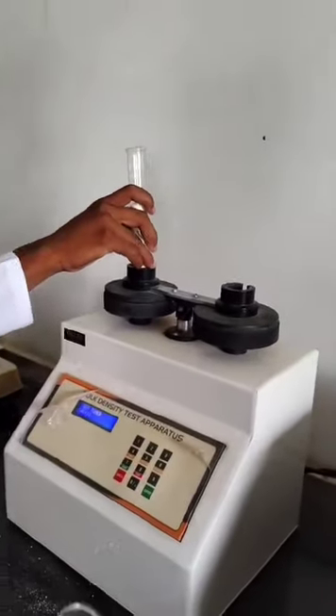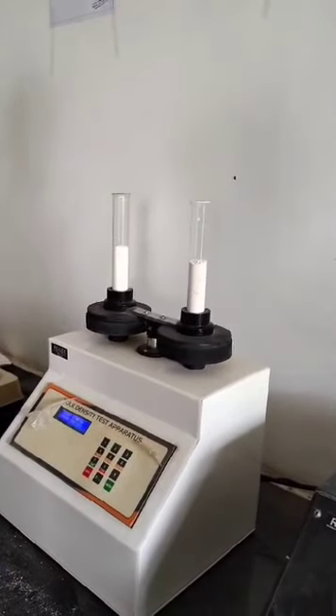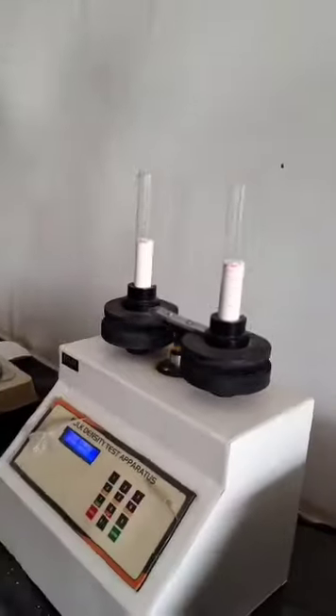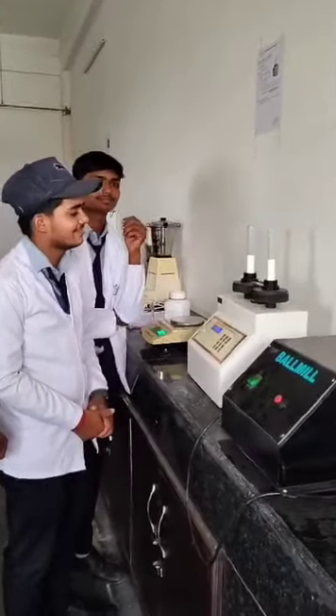Now we will track the cylinder and then start with the next cylinder. We are marking the next cylinder and will take the next cylinder to see how it works. We will start with the next cylinder and show it again.